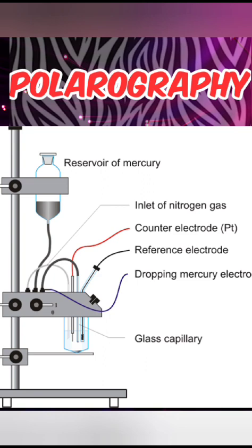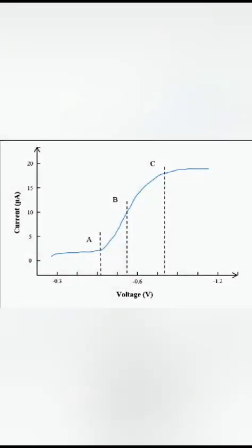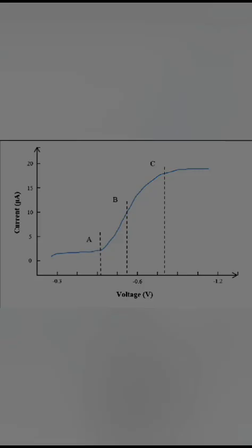The concentration polarization at the anode is negligible. Because of the large area, the anode potential may therefore be regarded as constant. Hence, the polarization of the whole cell is governed by the reaction occurring at the dropping mercury electrode, DME. On applying a steadily increasing voltage to the cell, a current-voltage curve is obtained. The curve is called a polarogram.